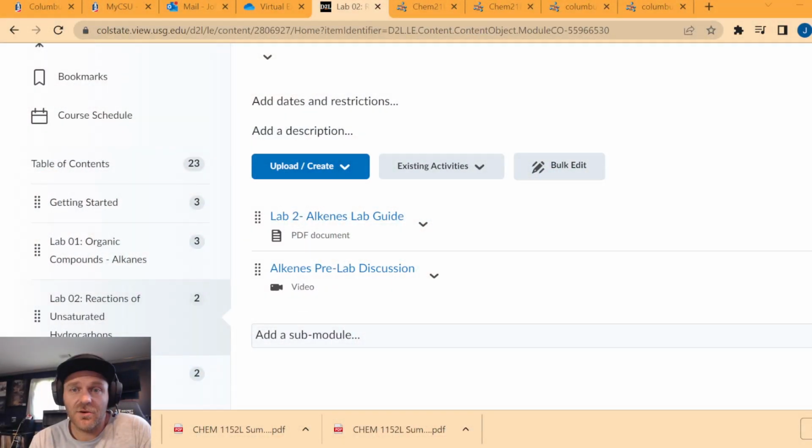All right, hey everyone. So this is the walkthrough for Lab 2. It's going to be very similar to the last one, Lab 1. We don't have the PowerPoint ready yet, so I'm just going to go through and show you the videos that Jamie did of the bromine test and the permanganate oxidation test.